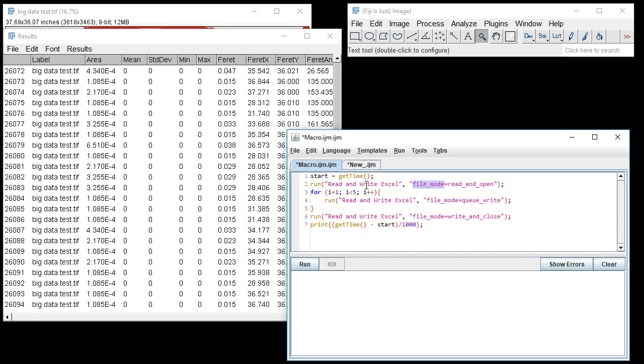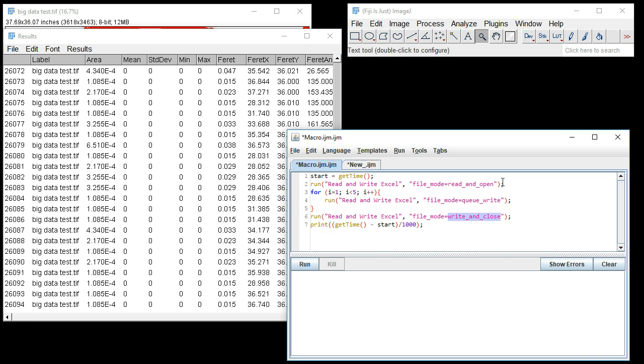You can see in this example loop where the data is exported four times, it'll be a lot quicker. You basically first have to call "read and open," then "queue write," and then "write and close." What this does is instead of opening and closing the file multiple times as it would in a regular workflow, the file will be opened or created once, all data will then be queued, and then all this data will then be written and the file will be closed all in one instance.